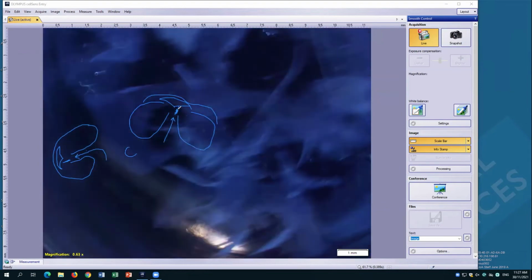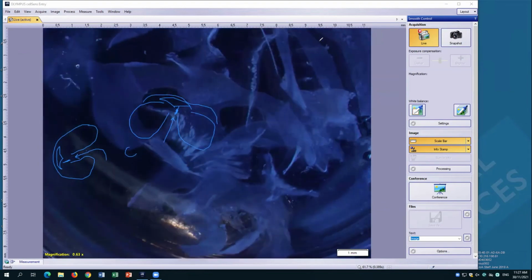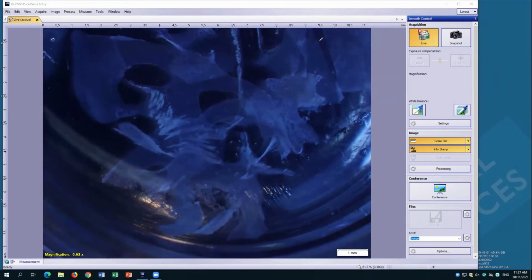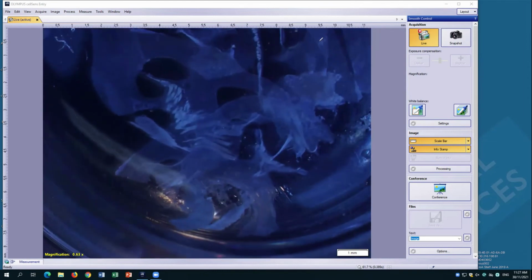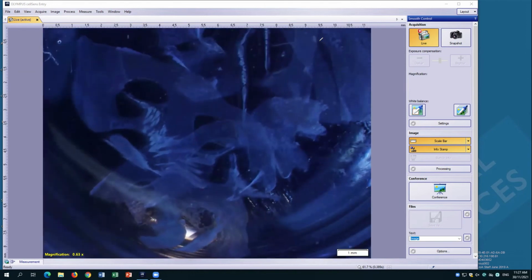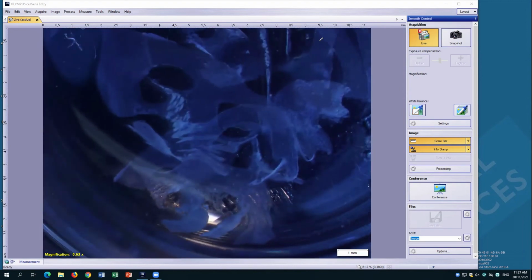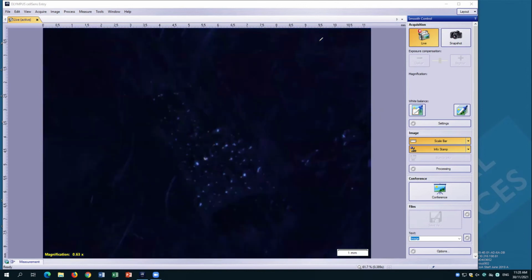So that's a tissue section, and it's floating because this one is 30 micron thin. For something that requires thinner ones with more resolution, for this type of sections, we've first frozen the sample in section, then we can go down to about 10 microns. If we want to do electron microscopy, we have to go to nanometer sections. So that's the tissue section, and that's about it.